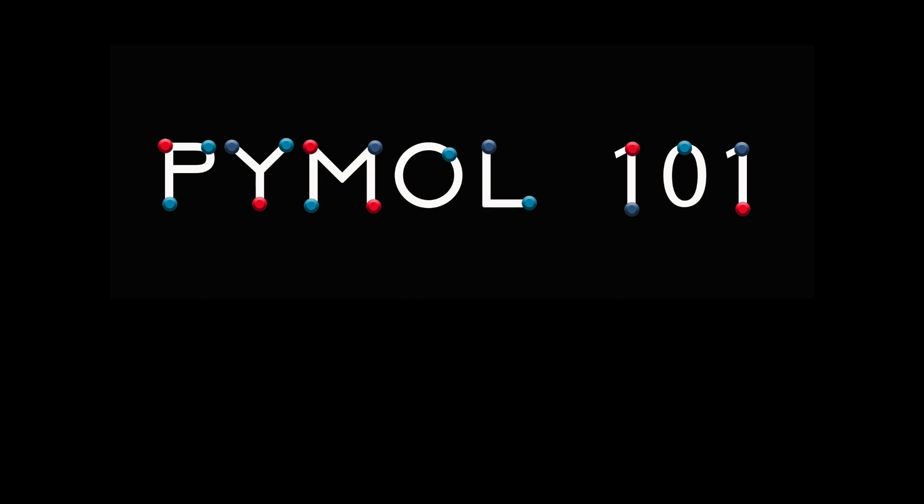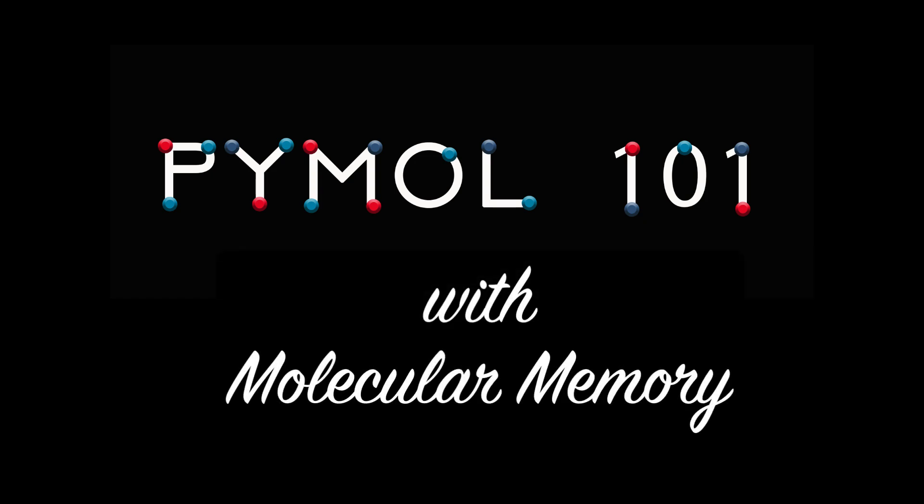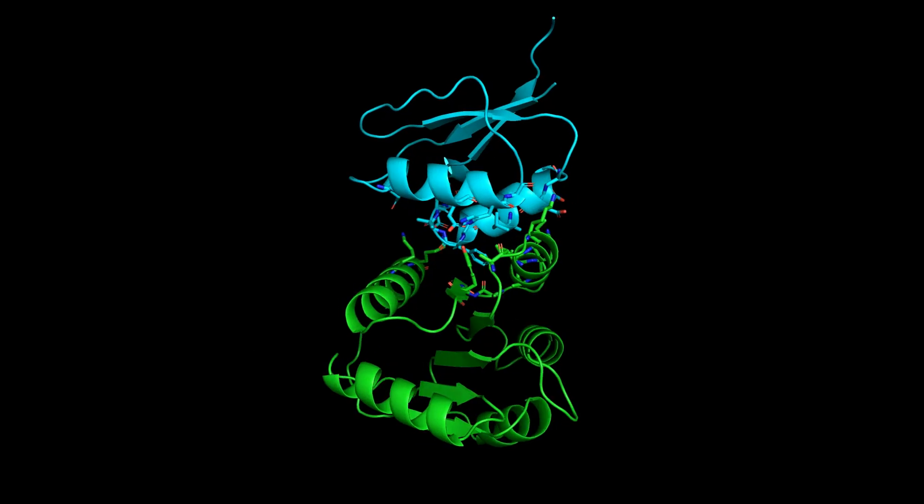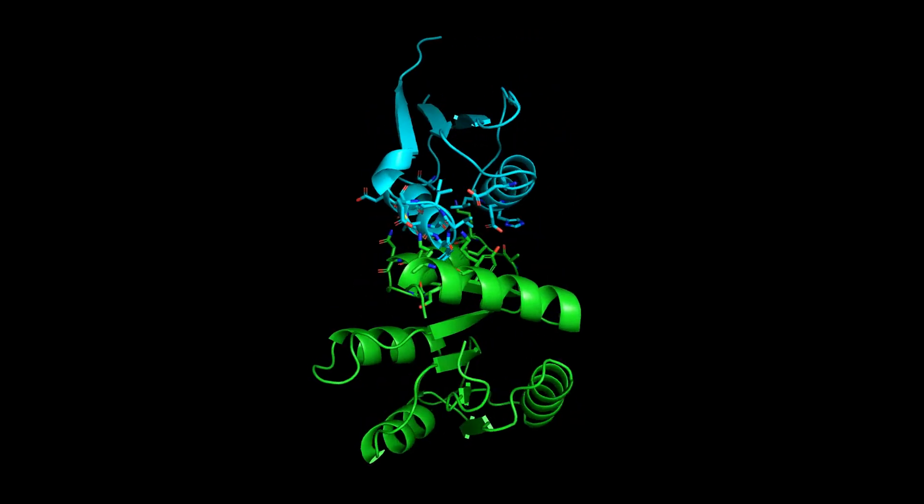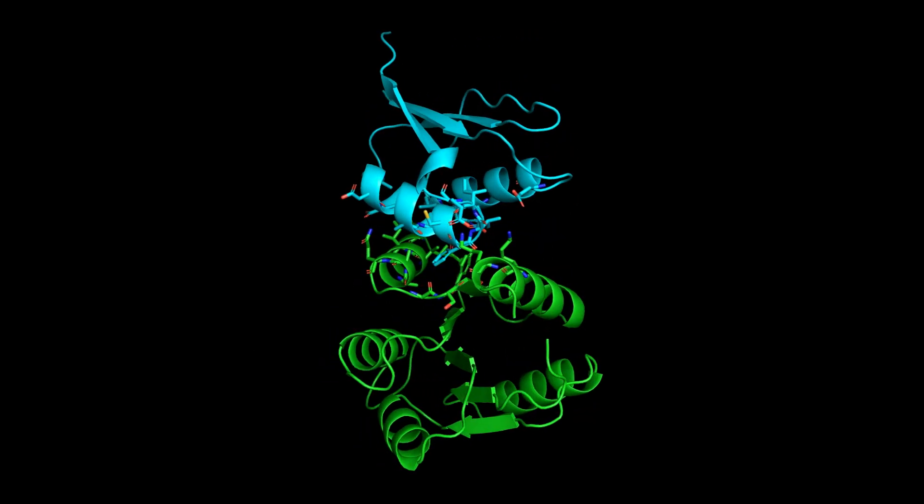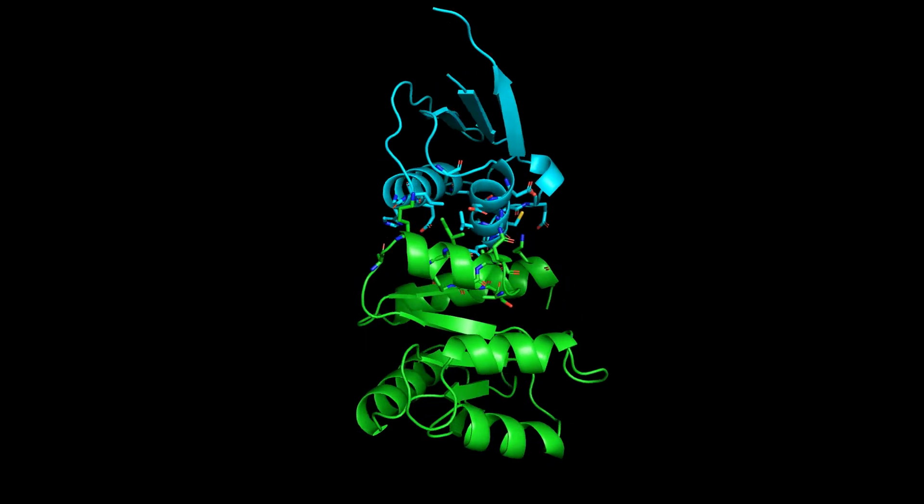Welcome to PyMOL 101 with Molecular Memory. Today we'll be learning about the molecular interactions that stabilize secondary structure. We'll use the structure from last time. These proteins interact to modulate the movement of bacterial flagella.